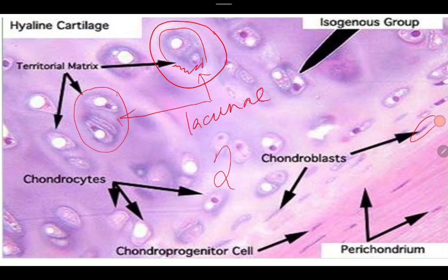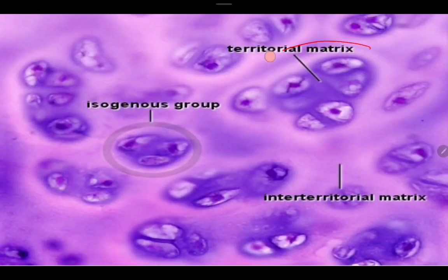Okay, itong tinuturo dito ng mga chondroblasts, no, that is the immature form of your chondrocyte. Okay, makita niyo magkaiba ang kanilang shape, no? Elliptical ang shape ng ating chondroblast, guys, no? Medyo pag ganun siya. Okay? That is your chondroblast. Okay? So, let's move on sa ating next slide for another mas detailed na picture. So, we have here a mas detailed na picture ng territorial matrix.